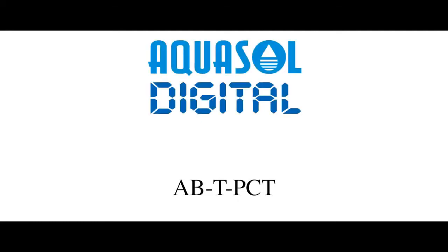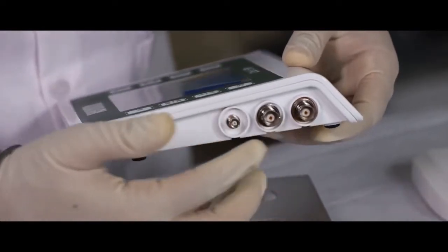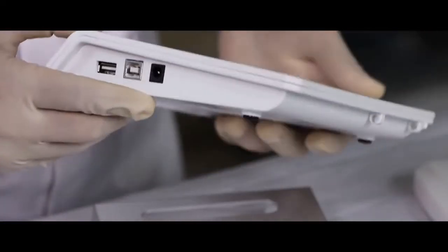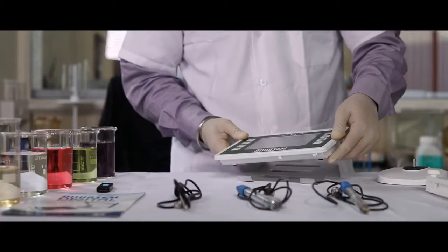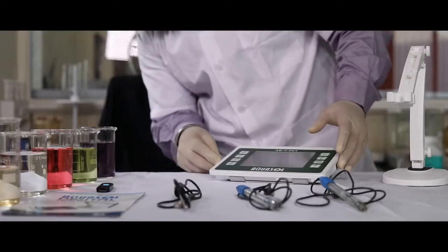This is a tabletop meter. Start by connecting the conductivity, pH, and temperature electrode, and on the other side, USB and power source. Install the stand and connect the electrode to the unit.